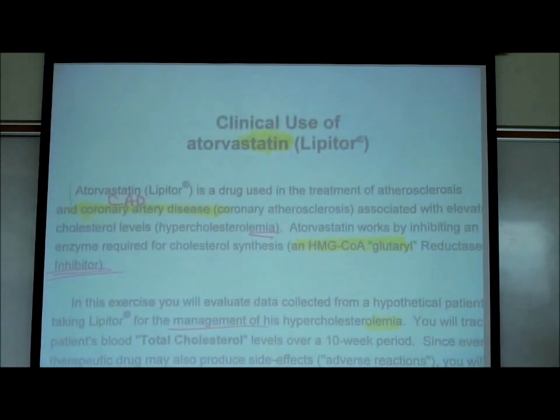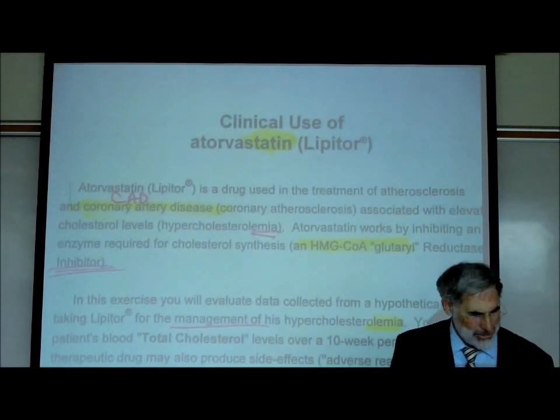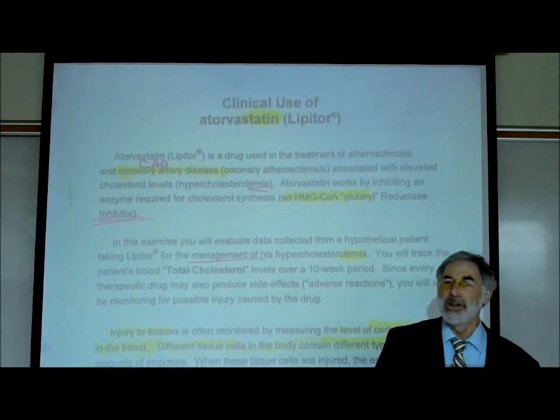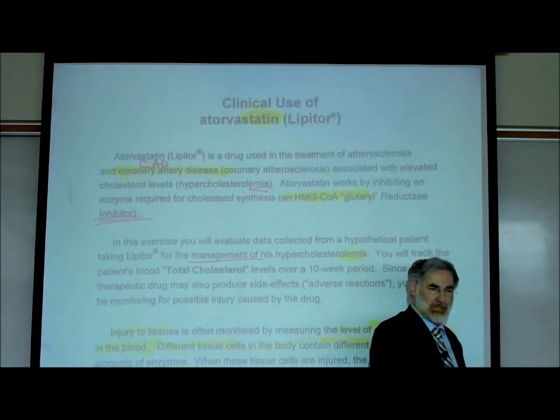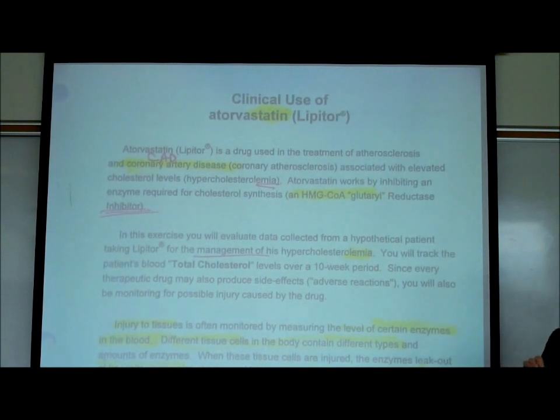Now with that in mind, let's take a look at this other handout we gave you, the clinical use of atorvastatin. In any physiology class that you would take, no matter which teacher you'd have, they'd probably do a lab exercise with the spectrophotometer, just like you use it in chemistry and microbiology classes. What I tried to do, though, is make this extremely clinically relevant, as you're going to see.